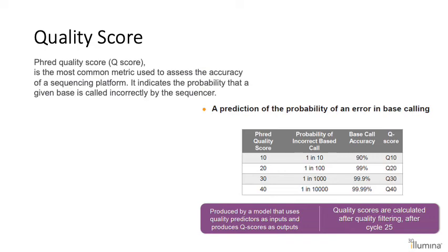This means that the base call accuracy is 99.9%. A lower base call accuracy of 99% is equivalent to a Q-score of 20. This means that for every 100 base pairs that have been read, they will contain at least one error. When sequencing quality scores reach Q30, virtually all the reads will be perfect.